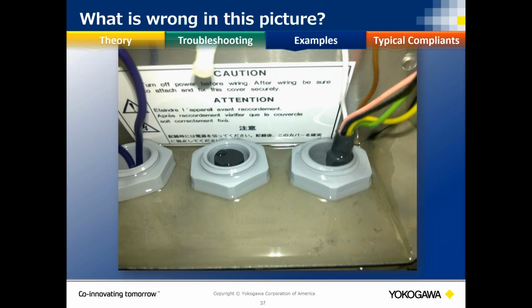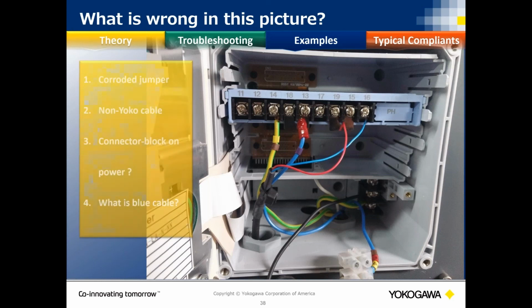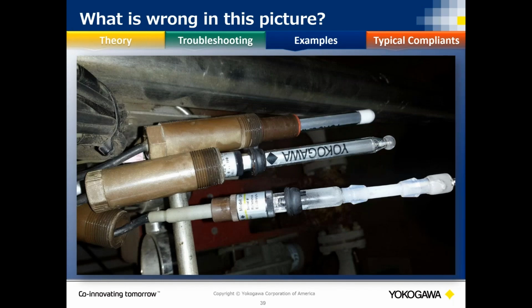You'll see these, and we're going to have to skim through them quickly. Water ingress, visually check. You're going to get alarms if you don't turn them off before you get to this point, but you can visually see this. We call it wet feet. When we're mixing and matching cables and sensors, we need to make sure that we don't damage the cable, and make sure we're using jumpers that aren't corroded. If we're using corroded jumpers, you're not getting good continuity, so you're going to get errors in your reading. So basically looking for those kinds of things.